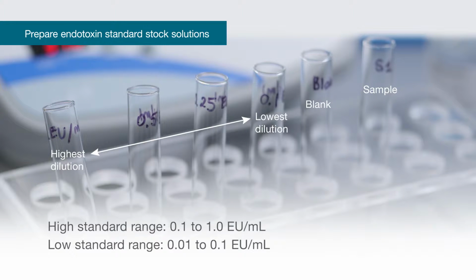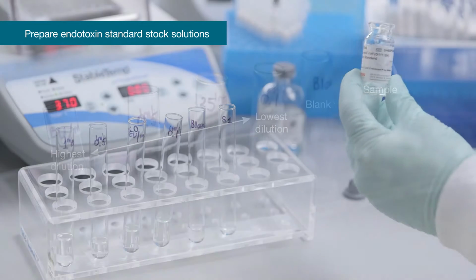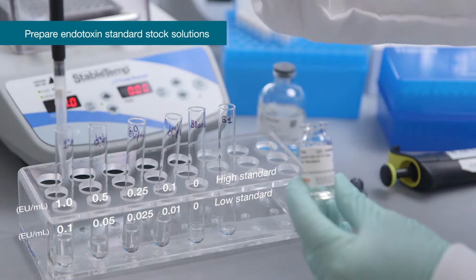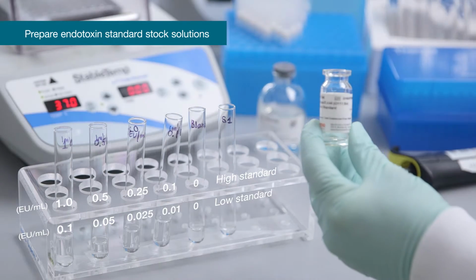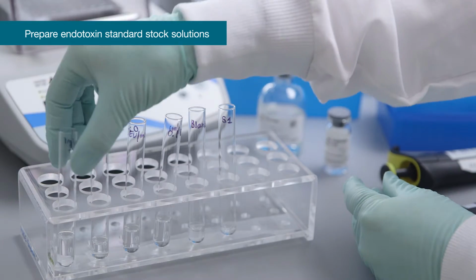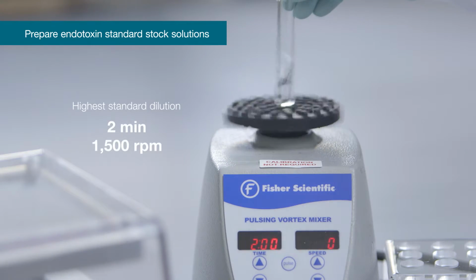Prepare dilutions for high standard or low standard range using endotoxin standard solution of 10 endotoxin units per ml. Make first highest standard dilution. Vortex 2 minutes.